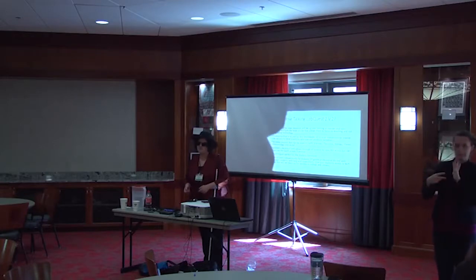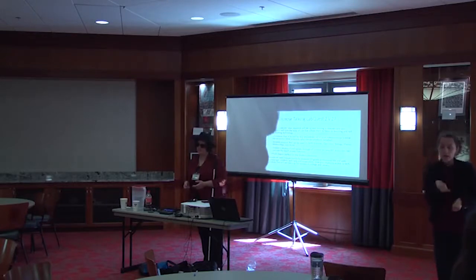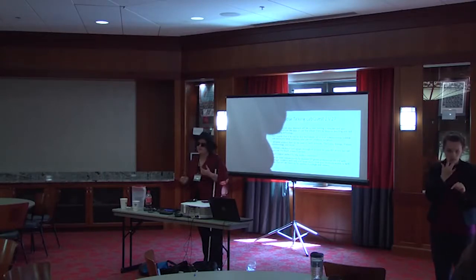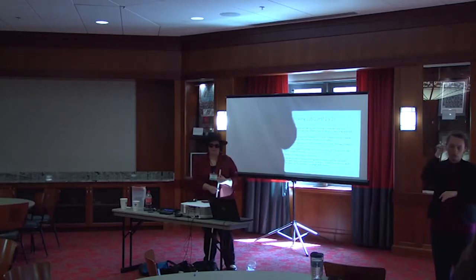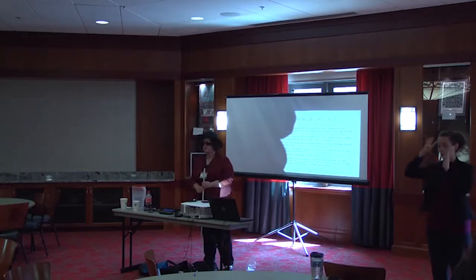Another new thing I forgot to mention was that the new ones do have Bluetooth sensor capability. So if you have somebody who doesn't want to deal with this wire mess, it's best for using smaller numbers of sensors, but you can always use Bluetooth. Note that there is a VIN number on here, so it's best to tell them which VIN number you're connecting to, because you don't want to have 20 of the same sensor in a room and accidentally connect to the person across the room.